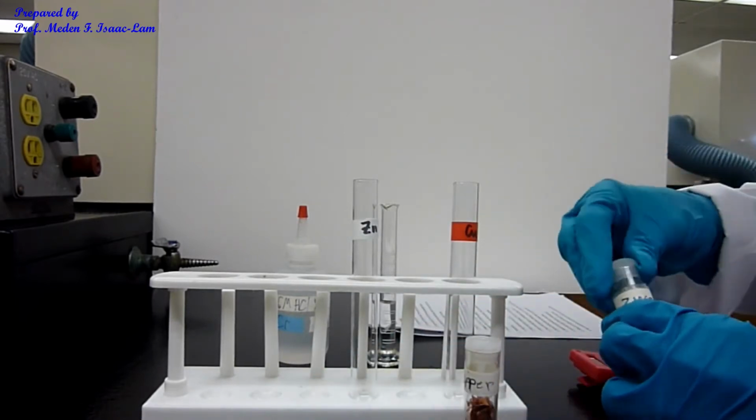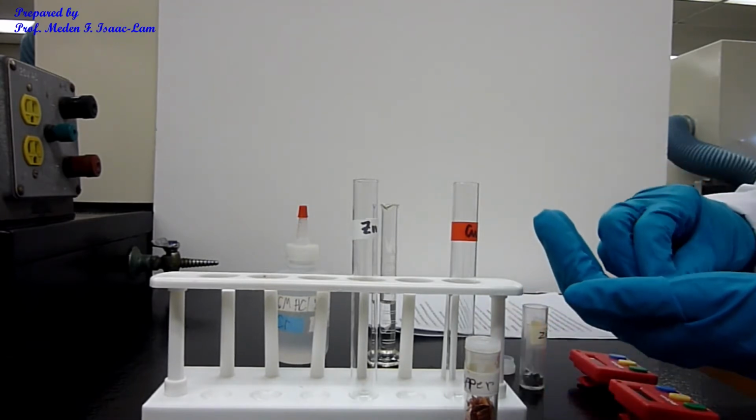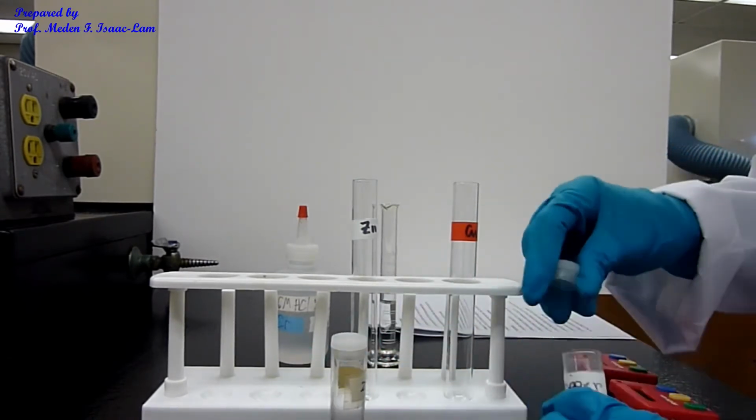So one strip of zinc, and then also one strip of copper.